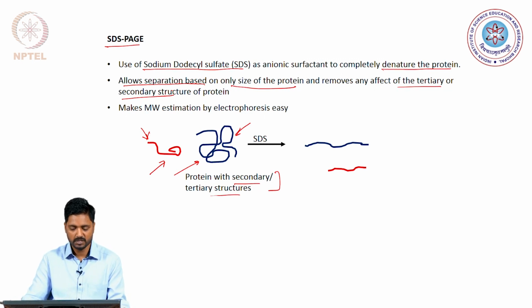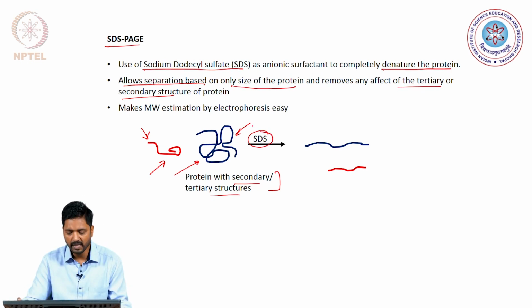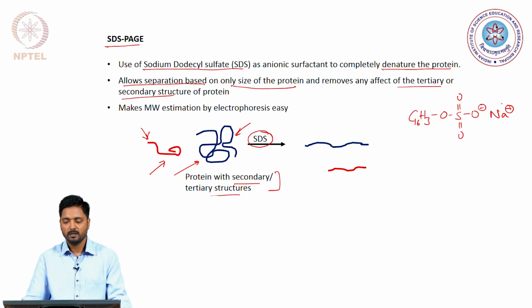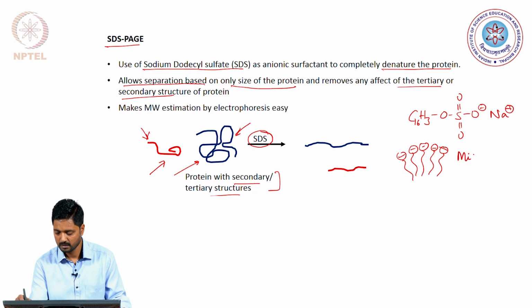So, what we have essentially done is, by use of the sodium dodecyl sulphate as the surfactant, we utilize this as a surfactant that can form micelles in aqueous medium, and these micelles screen out all the hydrophobic interactions.